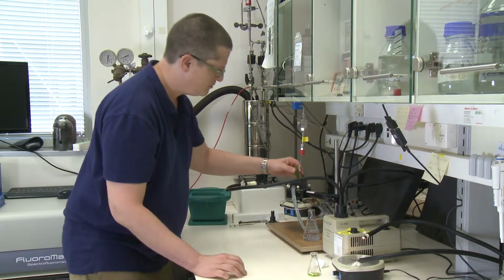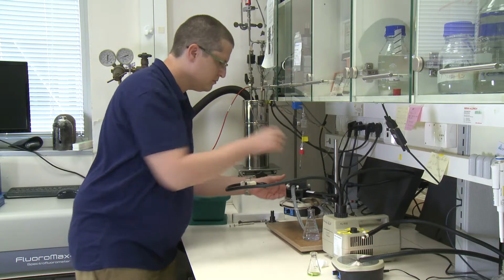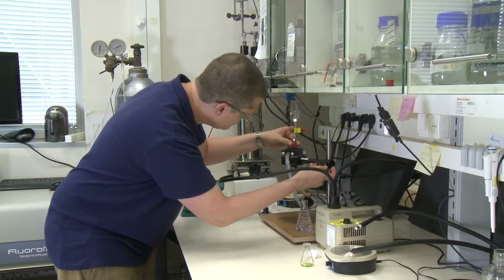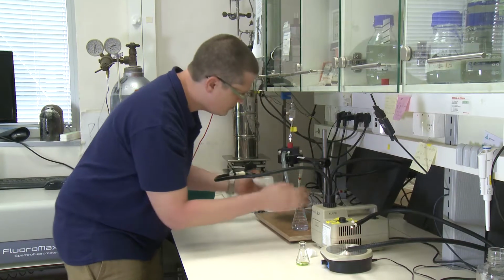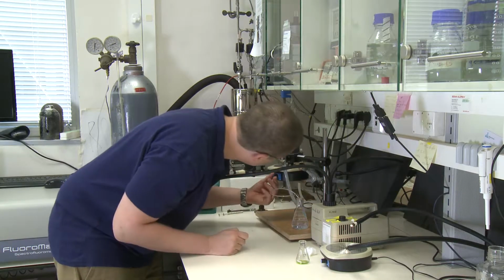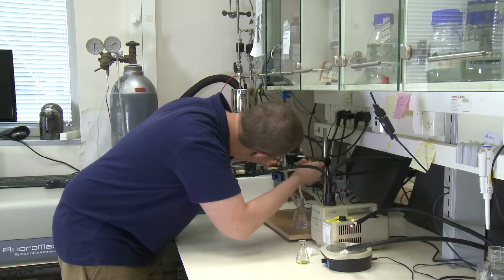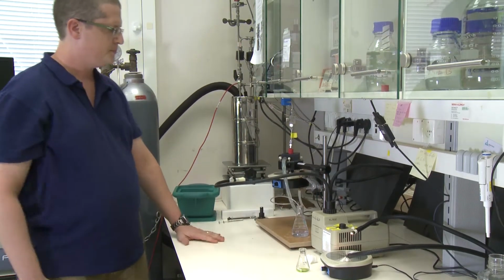Now he's inserting the nozzle, the sniffer, as we call it, inside the cuvette, and then he will seal it hermetically, so the gases that are formed cannot escape. So the only gas in there is the oxygen coming from the photosynthesis. We do not have any headspace of gas here. It's only liquid. So any gas molecule that is produced immediately goes into the mass spectrometer.